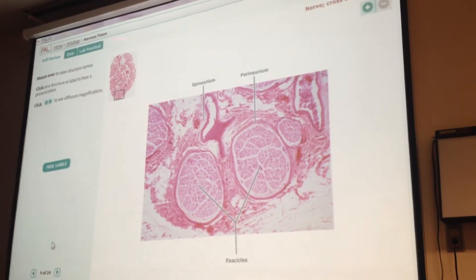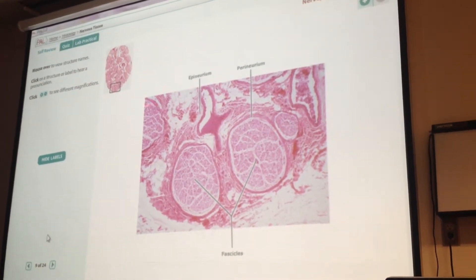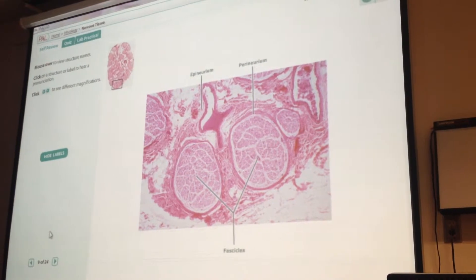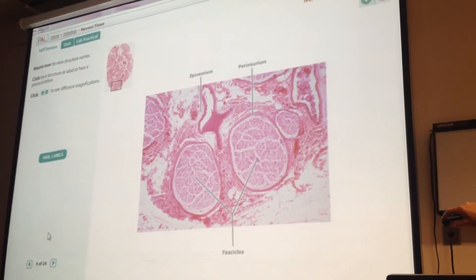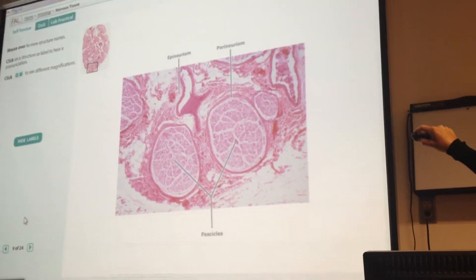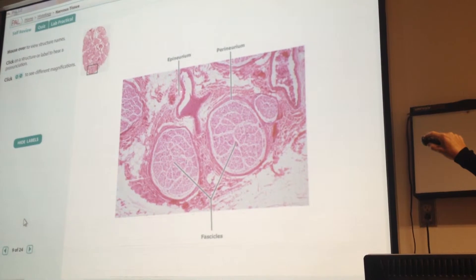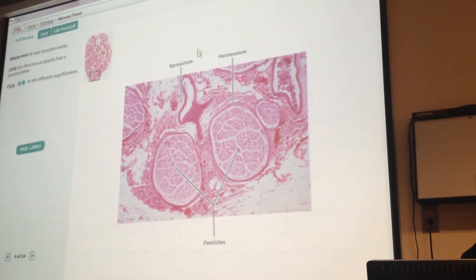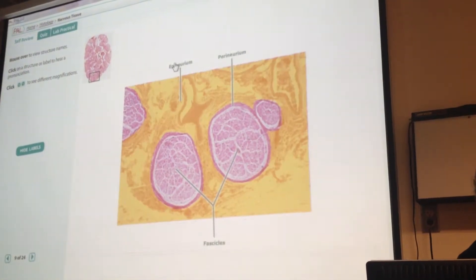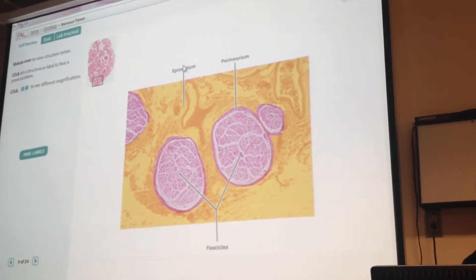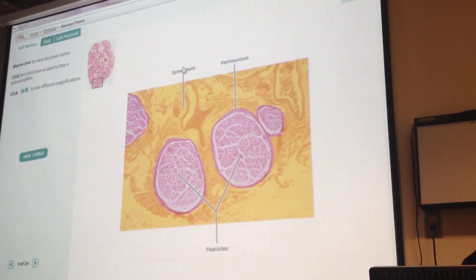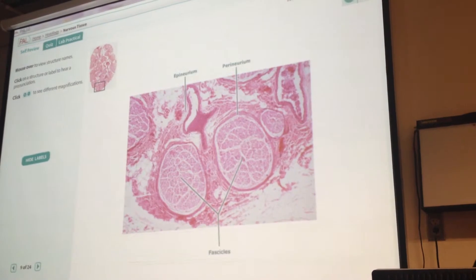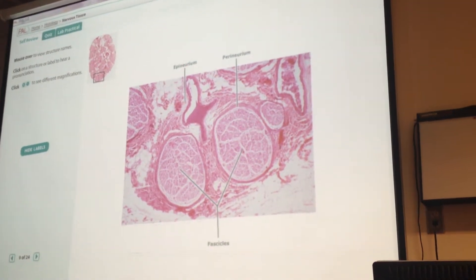So around the whole nerve is that epineurium — epineurium around the whole thing. Is that mislabeled then? Why does that say epineurium right here? Let's ignore that — I think that's wrong.